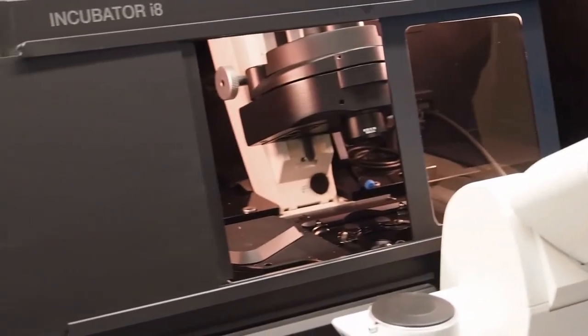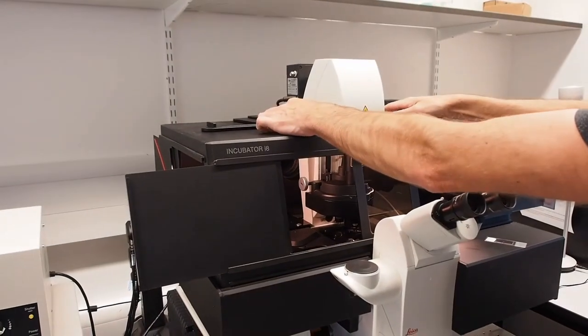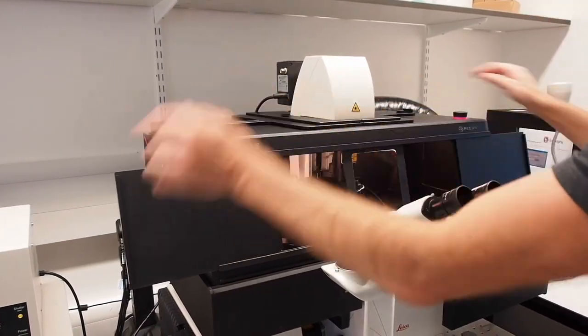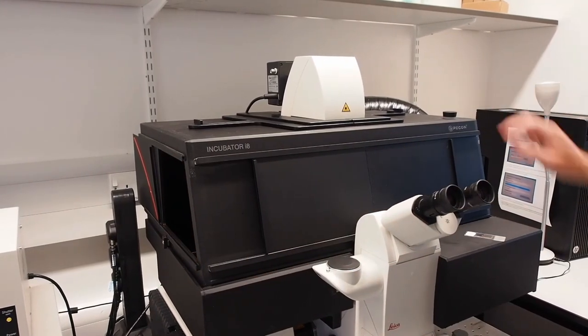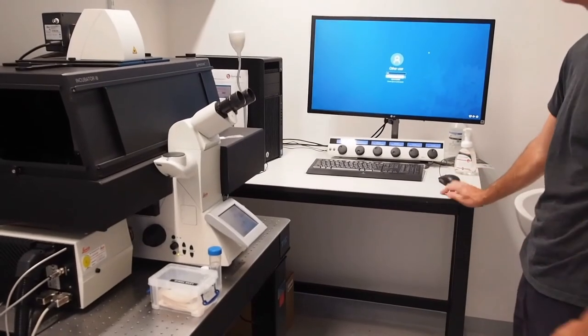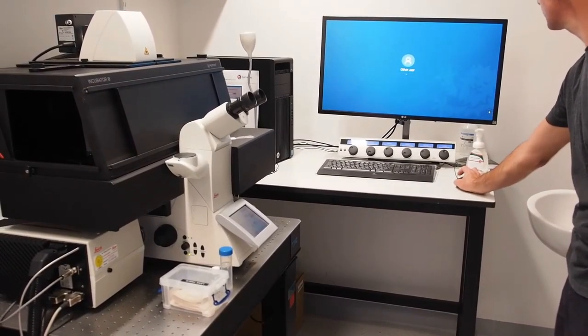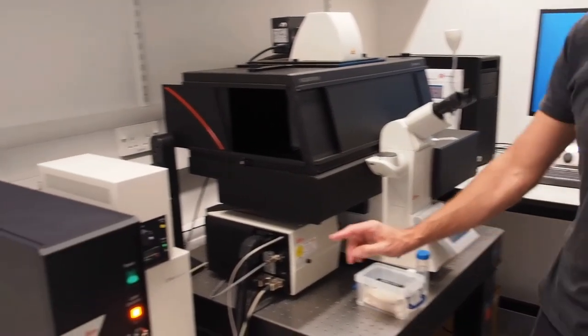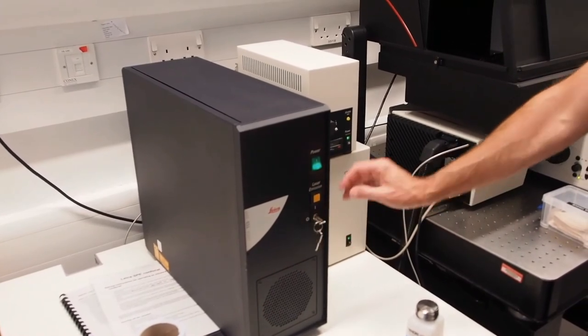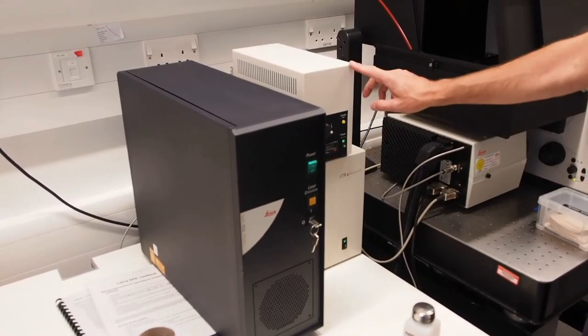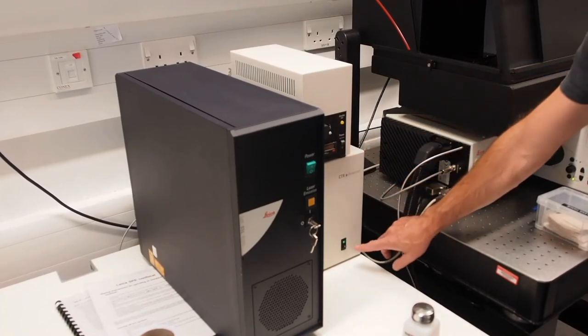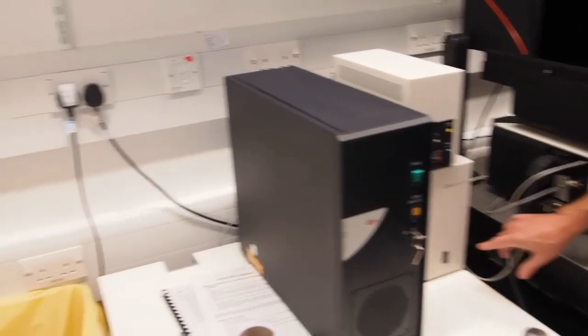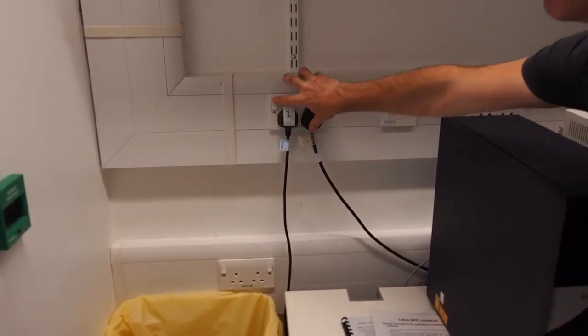Bring down the condenser. Close the incubator. And switch the light off. Shut down the PC. And then turn off the laser key. Power off. Switch the lamp off. And turn off the CTR advanced box. And finally switch off plug number one.